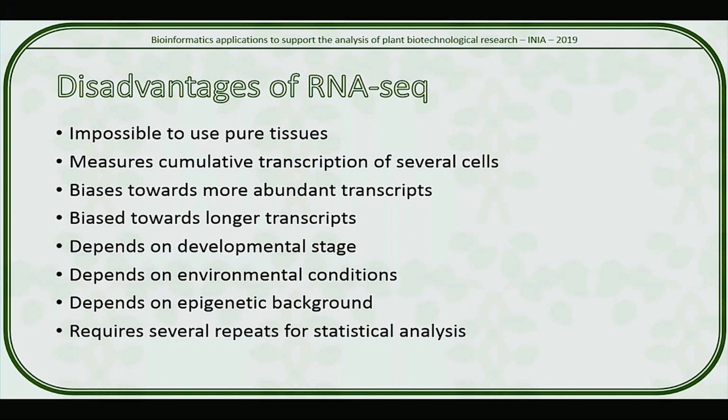And second, and finally, yeah, although the methods for RNA extraction and library construction have improved a lot, you still have a lot of background noise, as we call it, when we start sequencing RNA. That is, when we start counting how many reads from the same tissue in the same stage, from the same genome, map to a specific gene, we have a certain error associated to each of the repeats that we have. And that's gonna inform how the data is spread and how we should tackle it statistically. So the more repeats you have, the more reliable the results will be.